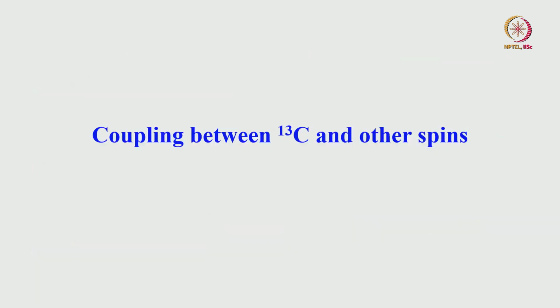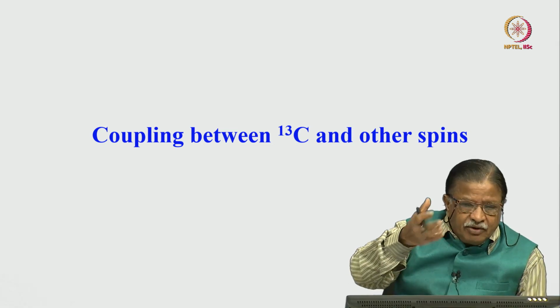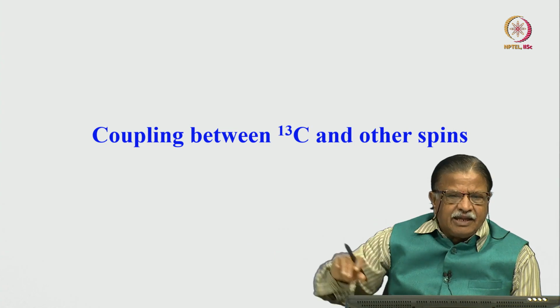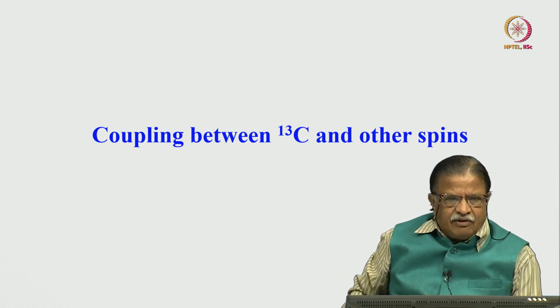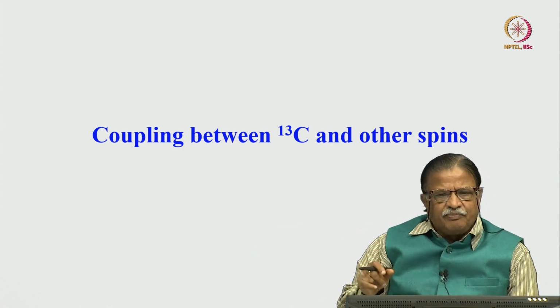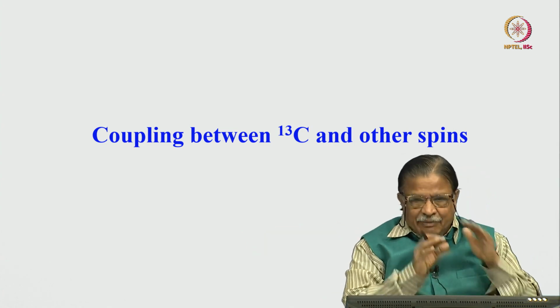Okay, we know how to analyze the spectrum. We know how to record the spectrum, how to interpret the carbon 13 spectrum, especially the phenyl carbons based on the substituent. Of course, there are several other tables for several other types of groups. Using the steric effect, we can calculate the chemical shift for linear chain molecules. There are aliphatic groups for CH3 chemical shift, CH2, CH3 in a long chain also we can do. There are several tables for that.